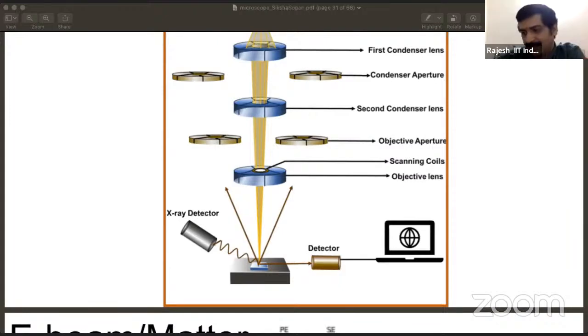Yes, exactly. See, the tip that you see, if you search some images, I should have put it, if you see the scanning electron microscope image of the tip that is used, it actually shows it's only a few atoms near the tip, and that is one of the reasons it increases the cost.